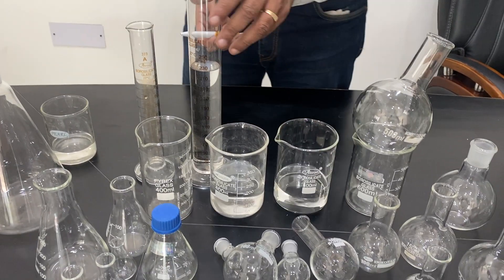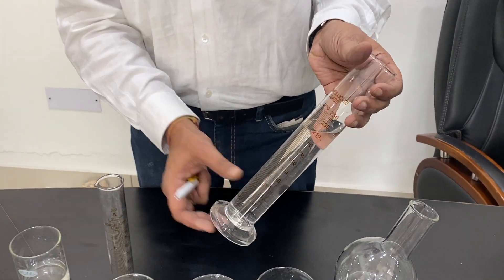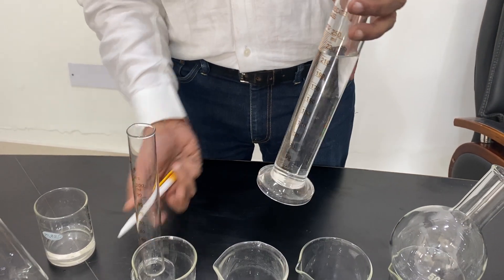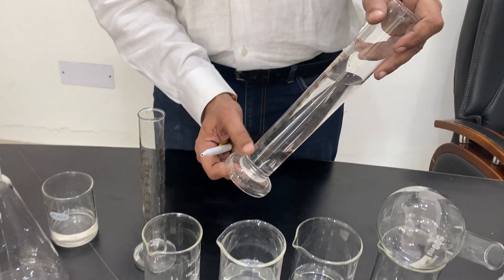Next comes the measuring cylinder. It has graduation from the bottom. It comes in different sizes: 2 ml, 5 ml, 10 ml, 50 ml, 100 ml, up to 5000 ml — all different sizes are available. One type has a round bottom and another has a hexagonal base.